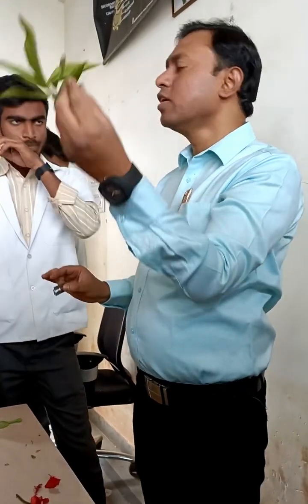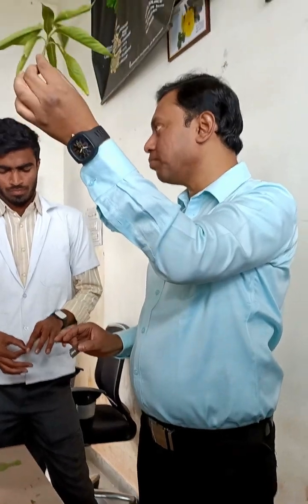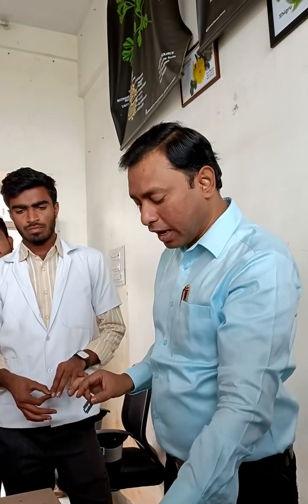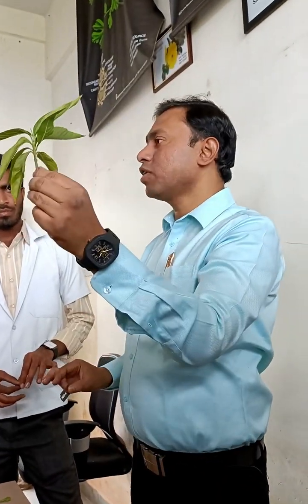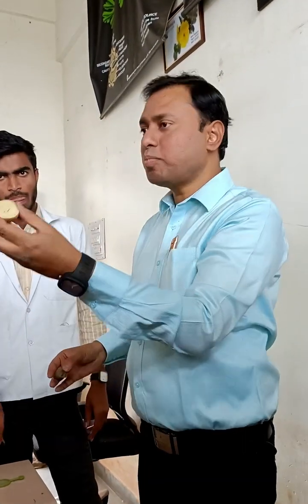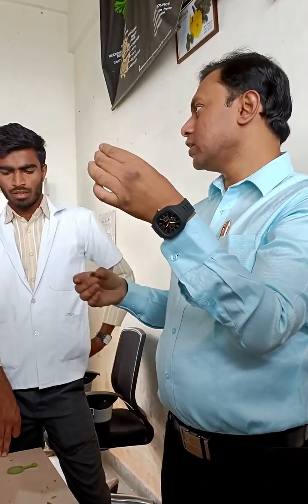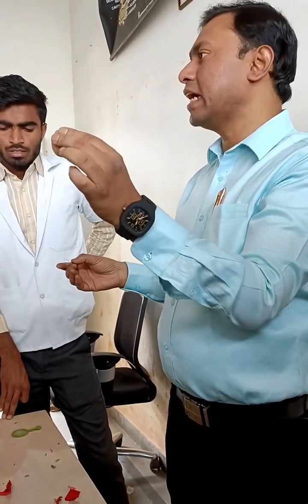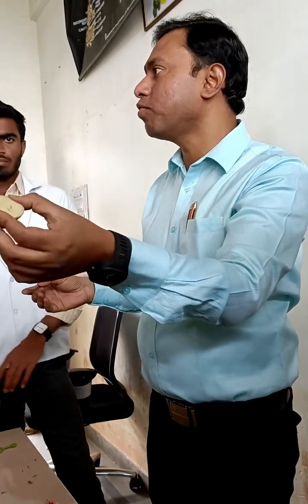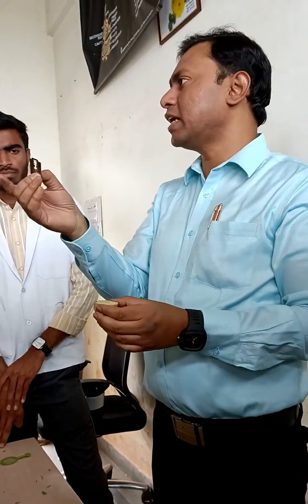Here, Adathoda vasica. Now, what are the things required to do this practical? The first one is the sample — that is Adathoda vasica leaf — and it is very delicate. You cannot cut the TS directly, that's why we are using the potato cubes to cut the sample. Because the midrib is very delicate, it cannot be cut with a simple blade, that's why we are using potato as a support.